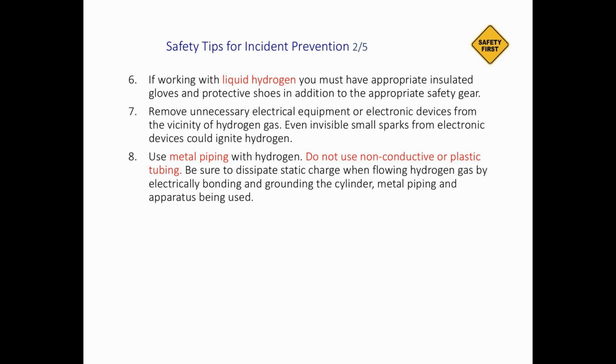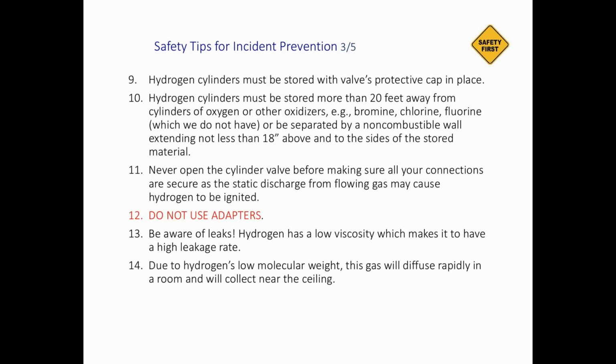Okay. A hydrogen cylinder must be stored with a valve protective cap when not in use. Not only the hydrogen cylinder, all cylinders, including flammable and non-flammable, should be kept capped if not in use. A hydrogen cylinder must be stored more than 20 feet away from oxygen cylinders and other oxidizers.